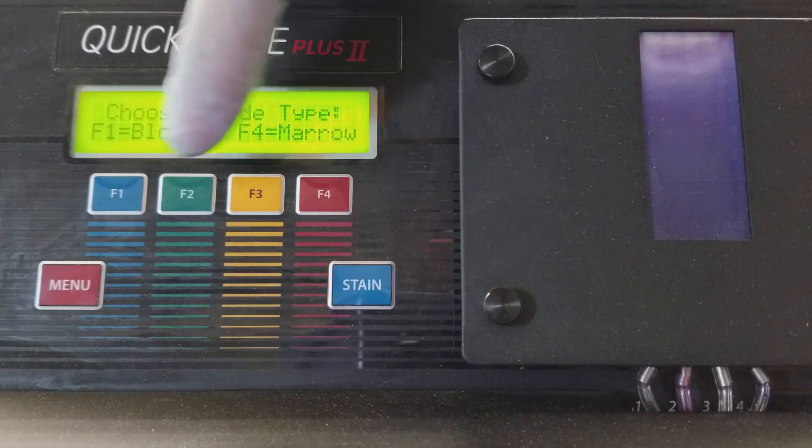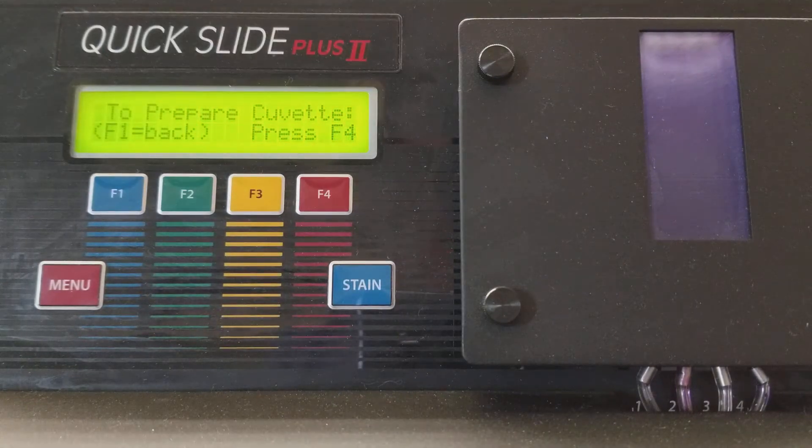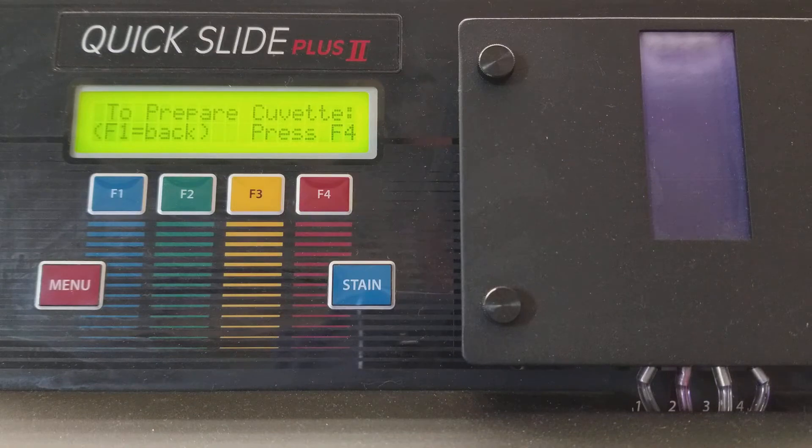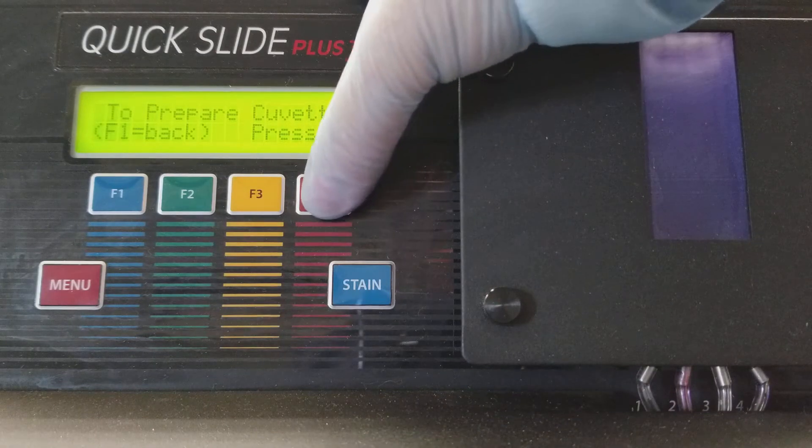So let's go ahead and press F1 for the blood and then it's going to prepare the cuvette when I press F4.